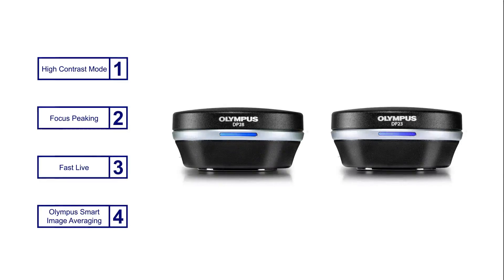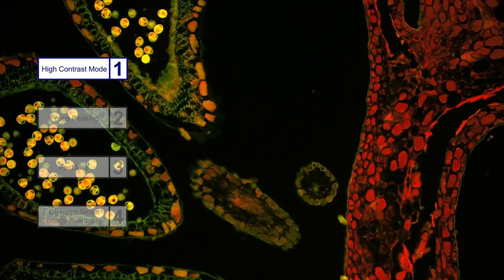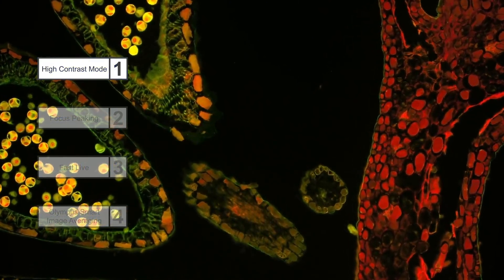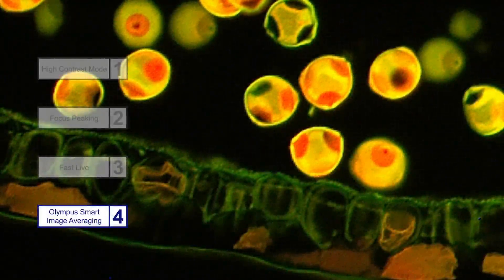In addition to high image quality, both cameras have smart, easy-to-use features such as high contrast mode to capture clear images with a high signal-to-noise ratio during polarization and fluorescence microscopy, focus peaking which shows you which parts of your sample are in focus, the fast live function which maintains a smooth live image even with dim samples, and Olympus Smart Image Averaging that minimizes image noise in real time with smart processing.